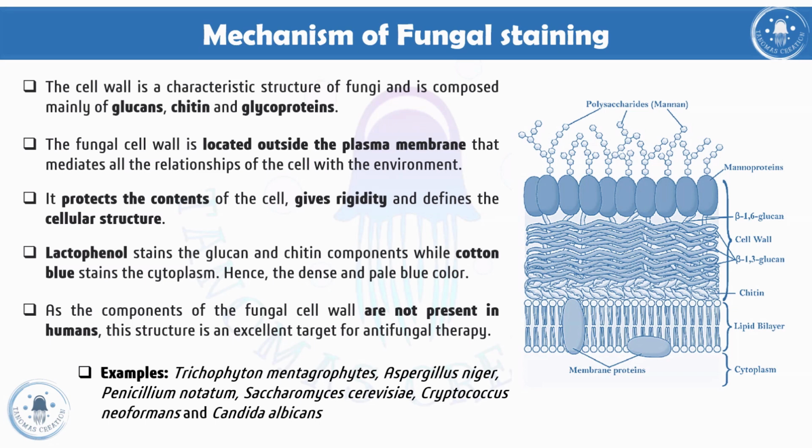Okay, so not all fungi are pathogenic, but some are, and they are very common contaminants that we face in our microbiology laboratories. Even in pharmaceutical industries also. Okay, so we need to avoid this fungal contamination.